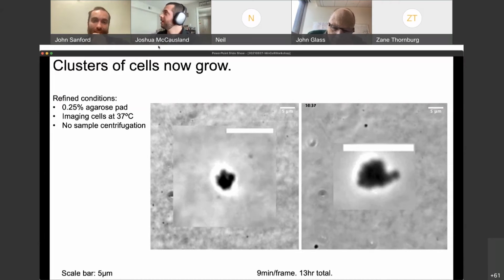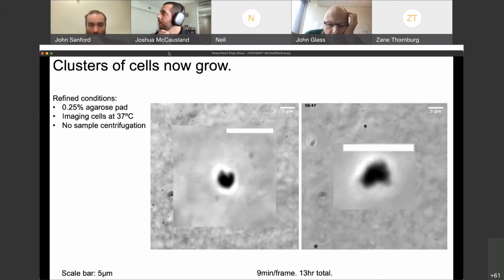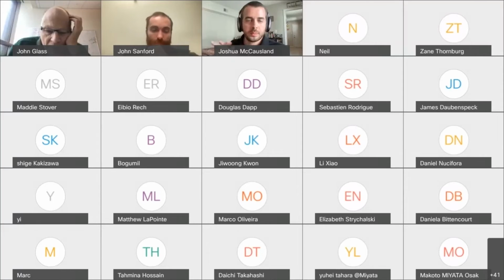Josh, if we could make your cells put a protein on the surface that would let them attach to glass, could you just grow them in liquid media, do you think? I've thought about that. The only concern I have is that, for example, with E. coli, adhering them to a cover slip does affect their physiology to some extent. I don't know how it would affect Syn3A, but it definitely would make things more well behaved. It's worth a shot.